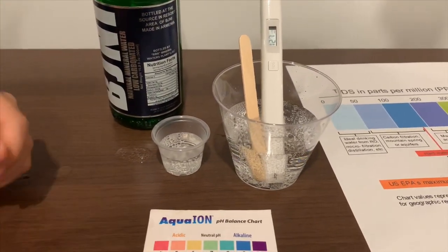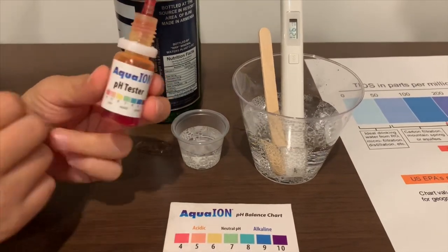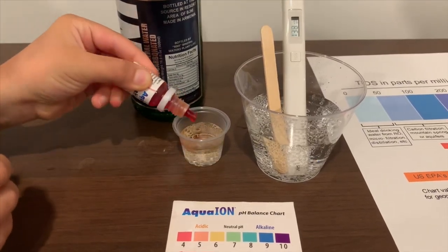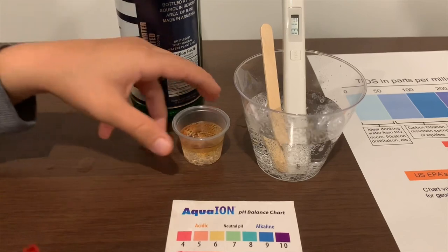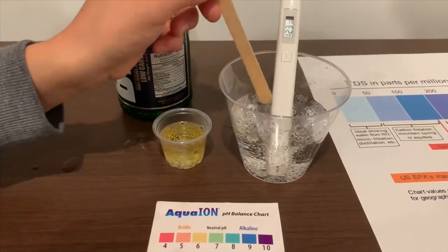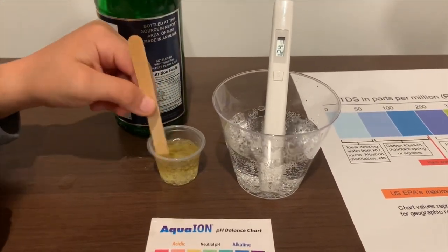Now let's test the pH level. If you want to buy this pH tester, the link is also down below. Only do two drops. Let's wait a little so we'll get a better result.